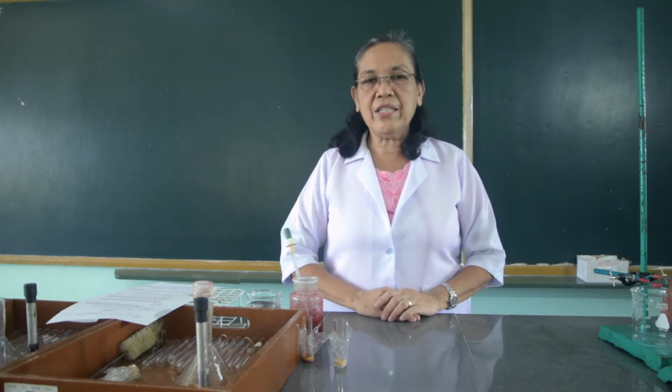Hi, good day. Welcome back to our class in biochemistry. Today, we will perform activity number 3 on colloids. The first procedure to be performed in colloids is the dialysis.